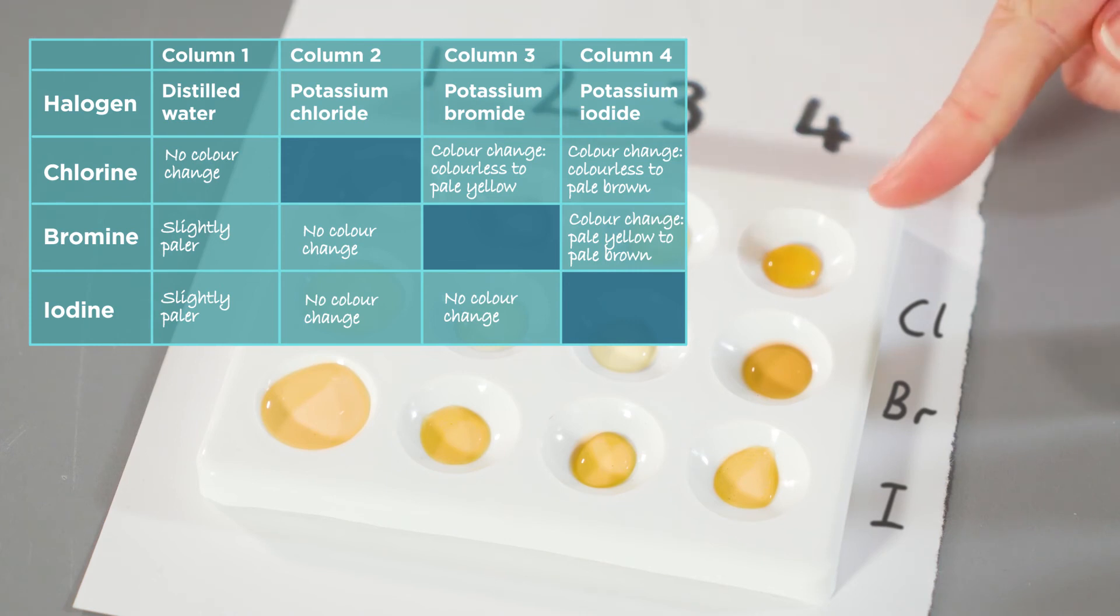Here we can see that there has been a colour change here and here. In each case, the iodide ion has been displaced by the chlorine and by the bromine that was added.